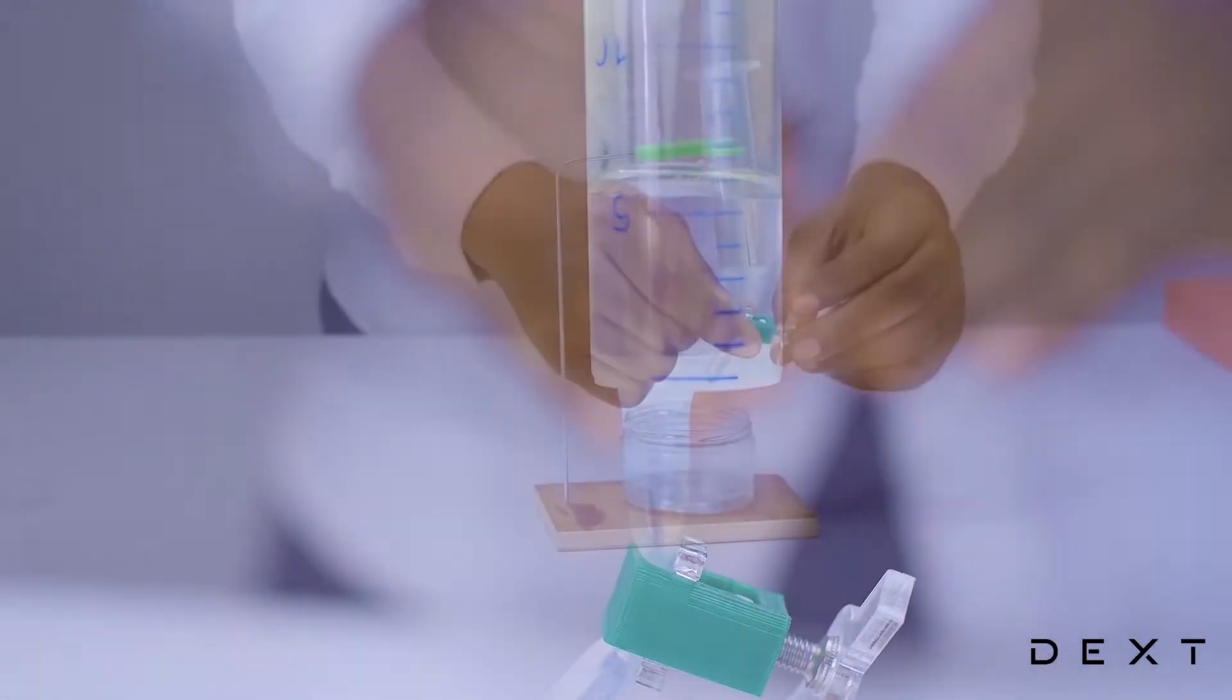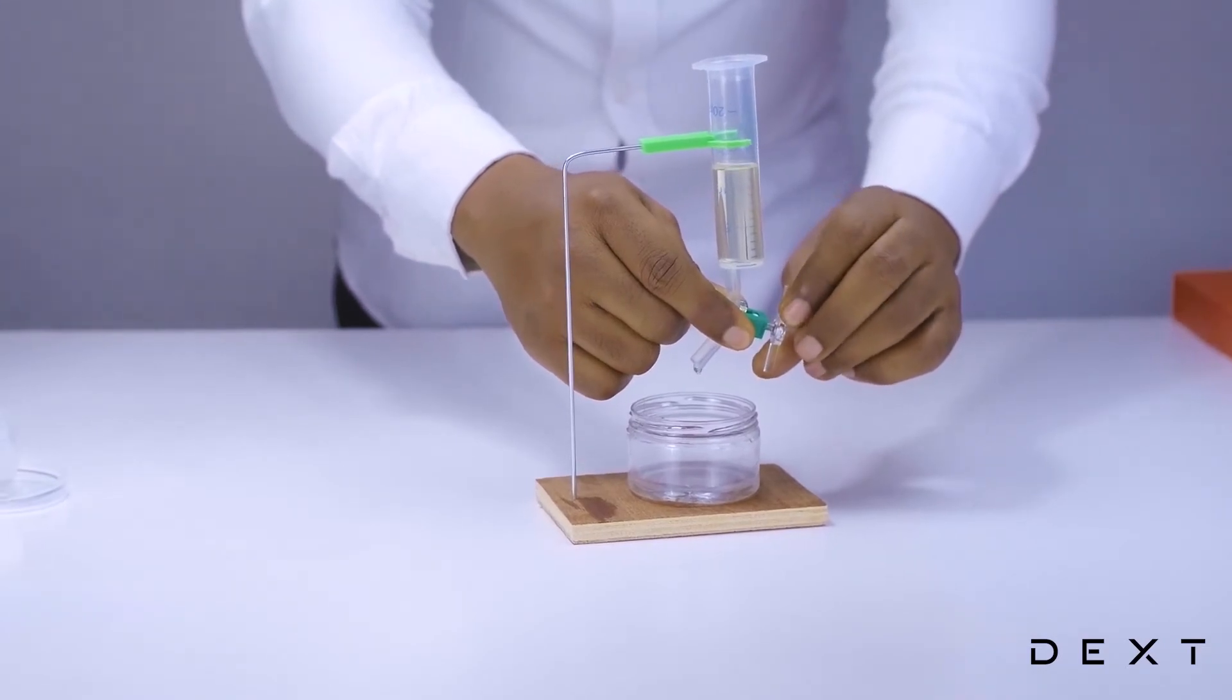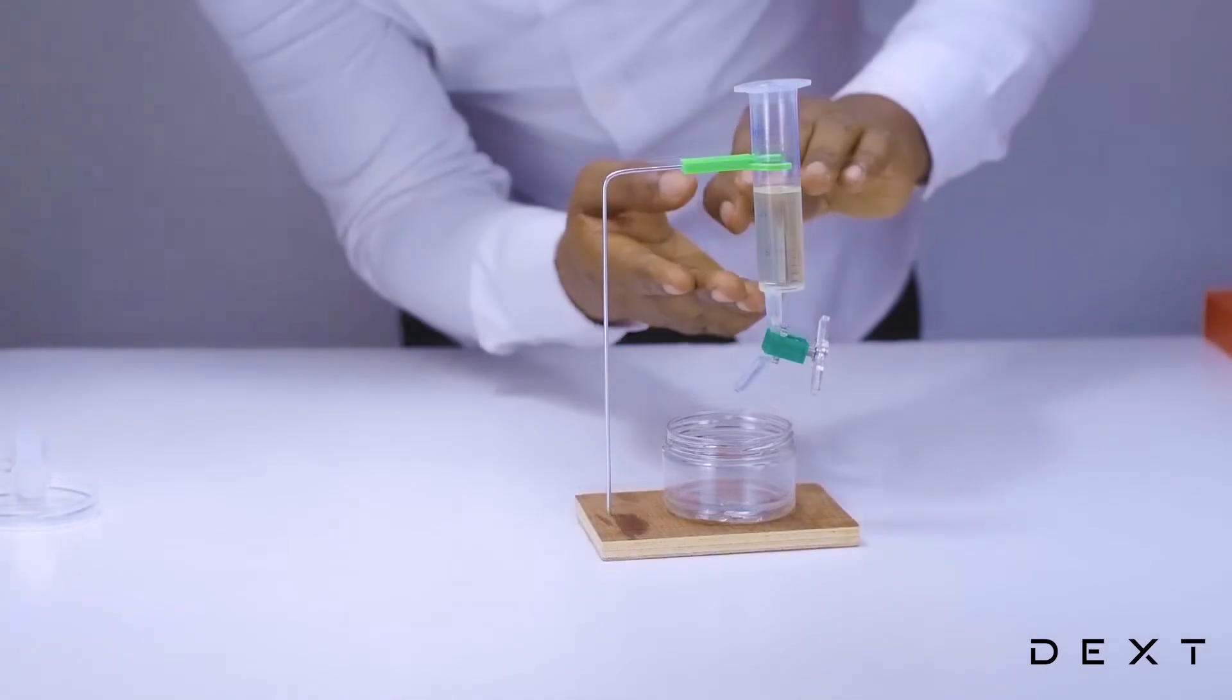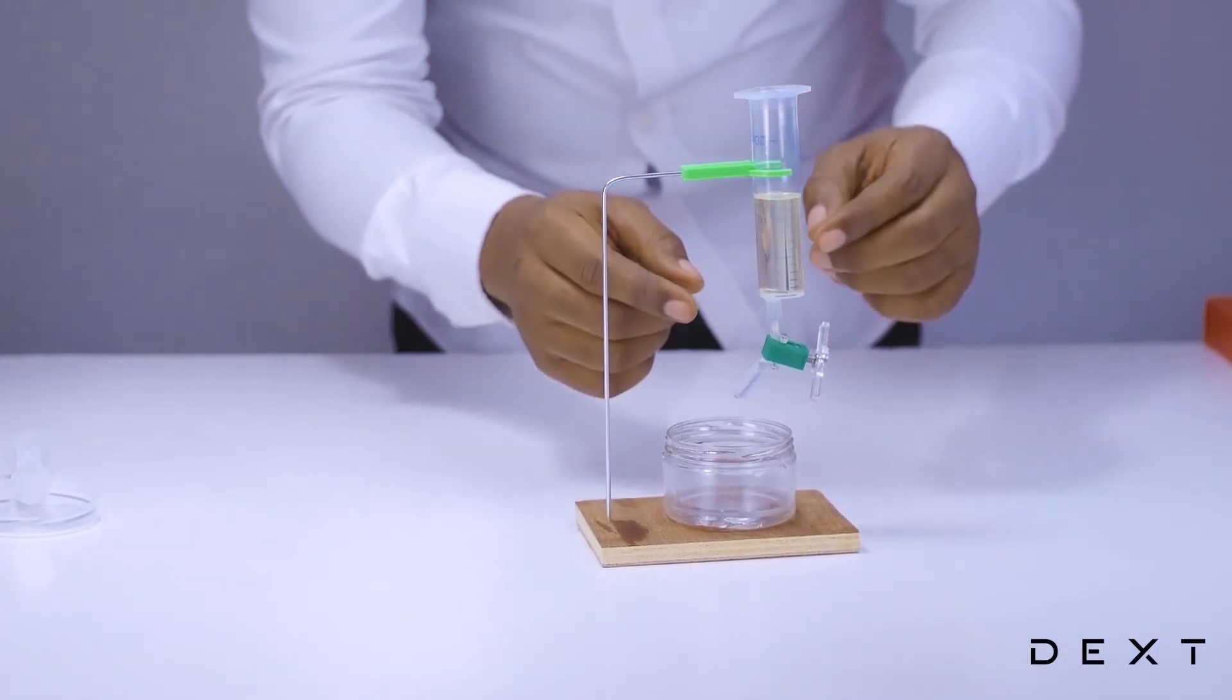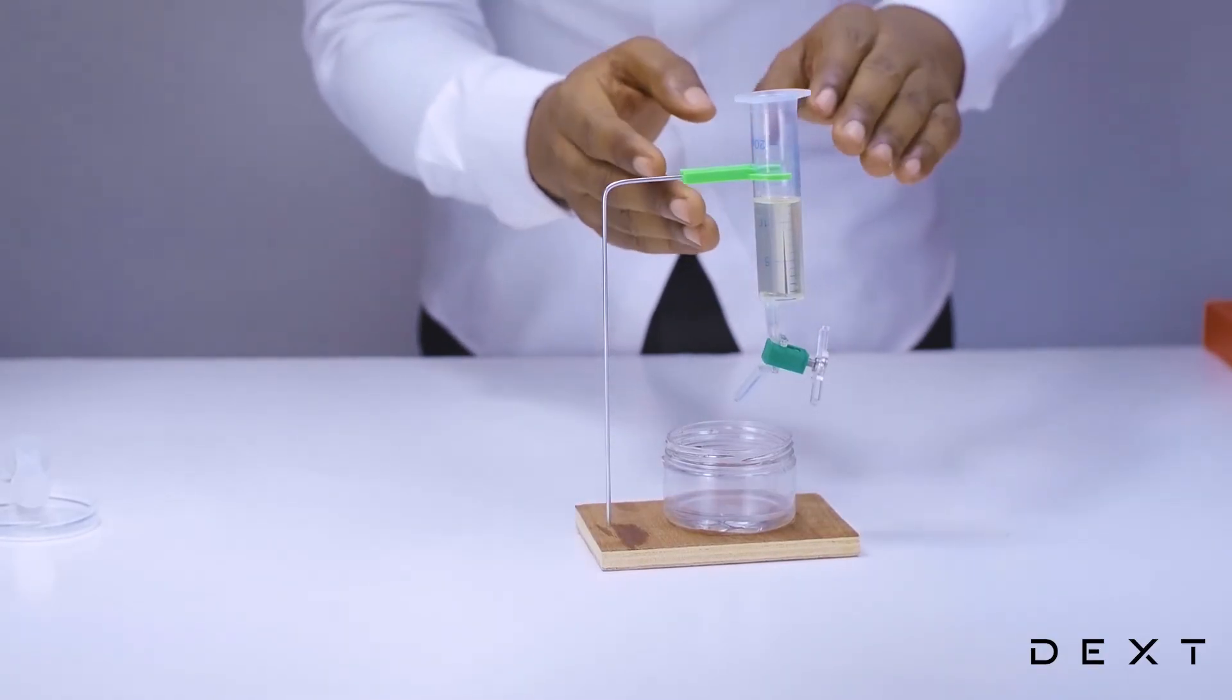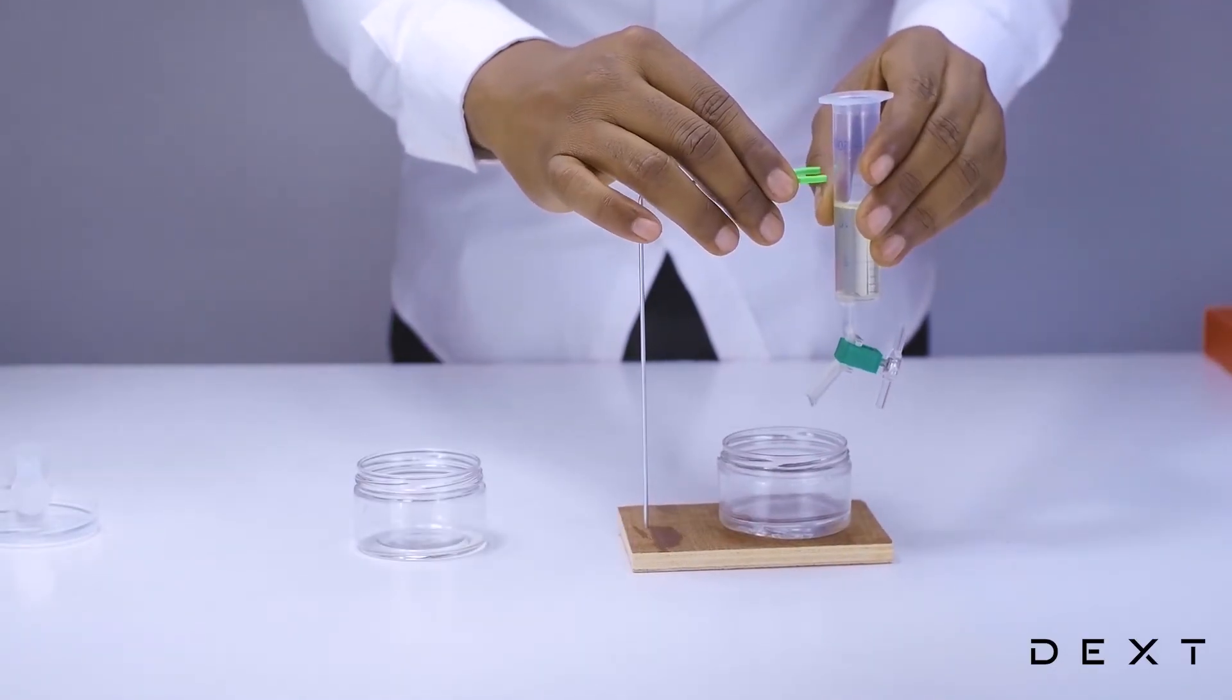Nicely done. Now as soon as the liquid at the base is fully drained, you close your tap. Do not forget not to let any of the oil drain through the tap. Now once you are done, you are going to take the oil and pour it out from the top of your improvised separating funnel.